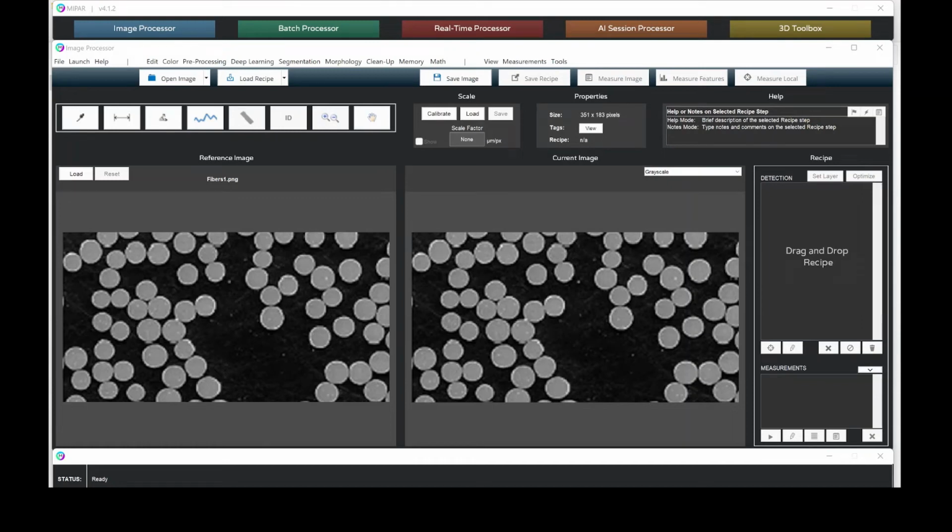When performing characterization of glass fiber cross-sections, images can pose unique challenges, including unclear boundaries, charging, uneven surfaces due to sample preparation, or varying contrast. In the past, this analysis would be done manually. An operator would measure the fiber diameter and record the result.